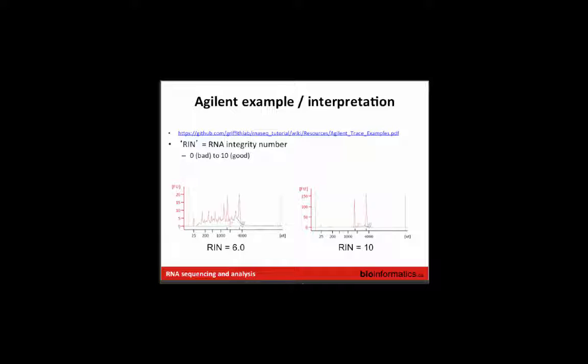Actually, the question comes from something I read in documentation where they just sequence the first few nucleotides, starting from the 5' end or the 3' end, and that's it. Yeah, so this is really intended for differential expression. You're referring to something with a lot of different names: GIS, SAGE, CAGE, various types of tag sequencing.